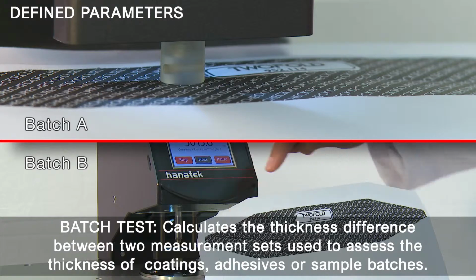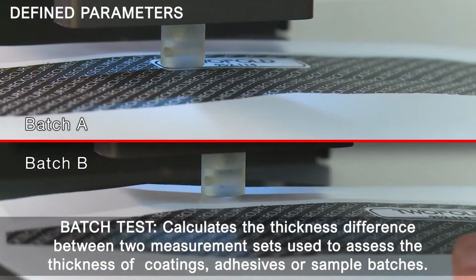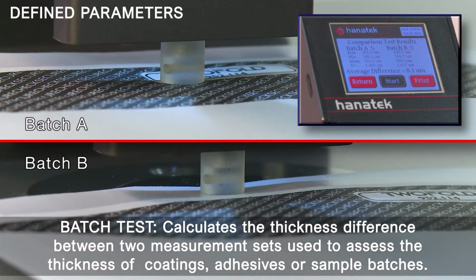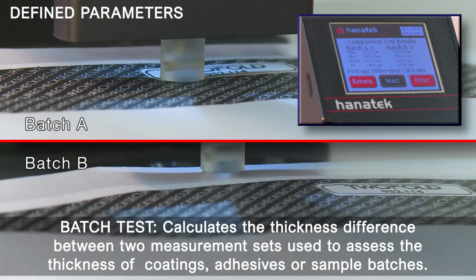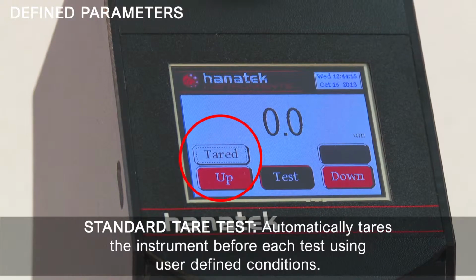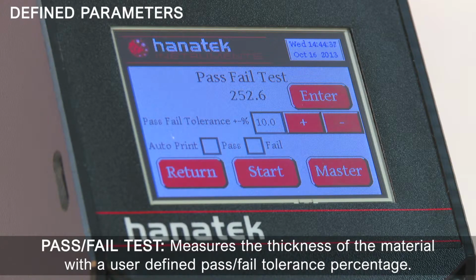Calculates the thickness difference between two measurement sets, used to assess the thickness of coatings, adhesives, or sample batches. Standard tare test. Automatically tares the instrument before each test using user-defined conditions. Pass-fail test. Measures the thickness of the material with a user-defined pass and fail tolerance percentage.